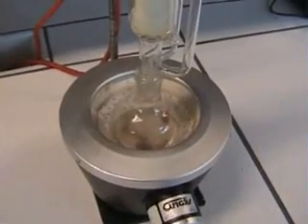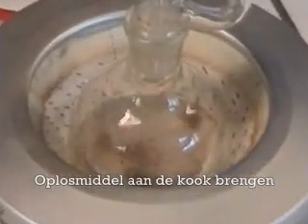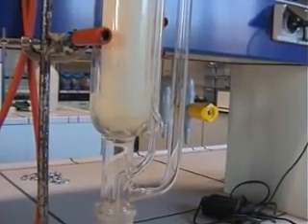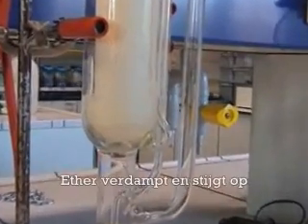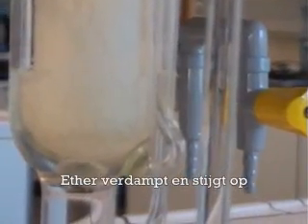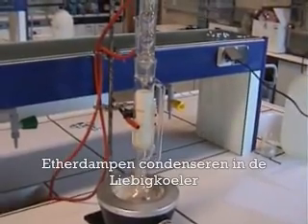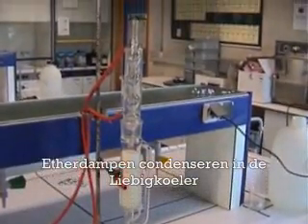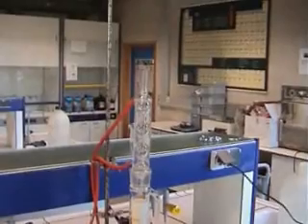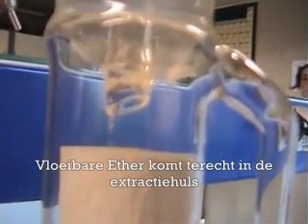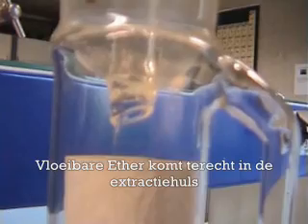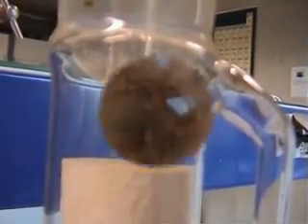Allereerst brengen we het oplosmiddel aan de kook met behulp van de warmtemantel. De vloeibare ether verdampt en stijgt in de wijde buis rechts richting de liebigkoeler. De etherdampen condenseren in de liebigkoeler. Het vloeibare ether komt vervolgens terecht in de extractiehuls, waar dat zich ook de pindanootjes bevinden.